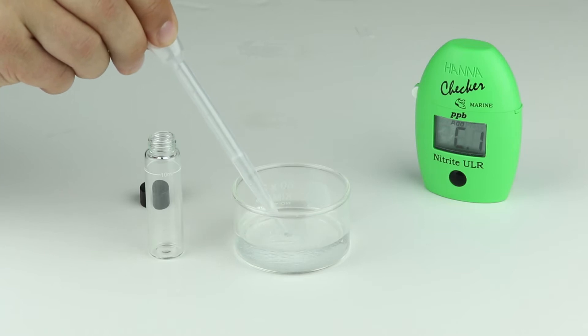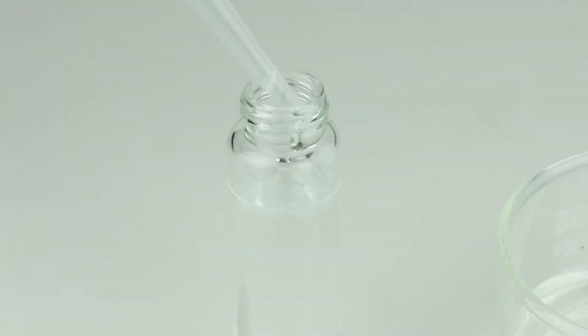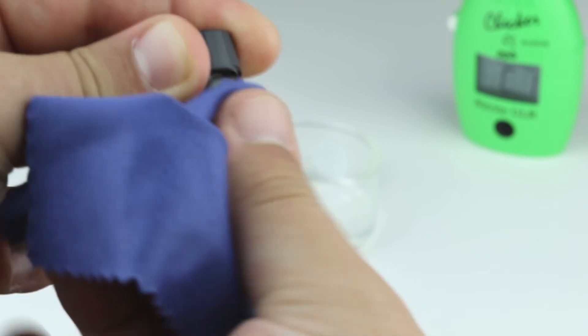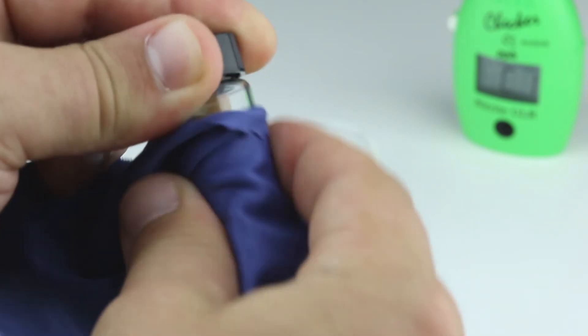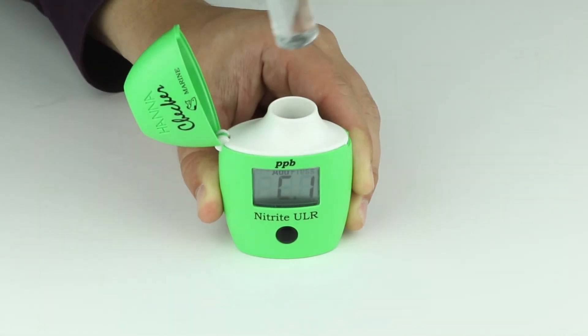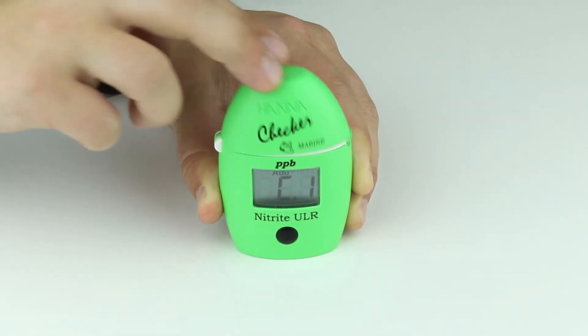Fill the cuvette to the 10 mL line with sample and fasten the cap. Using a microfiber cloth, wipe the cuvette to remove any oils or fingerprints from the glass. Then place the cuvette into the checker and close the lid, making sure it's completely closed.